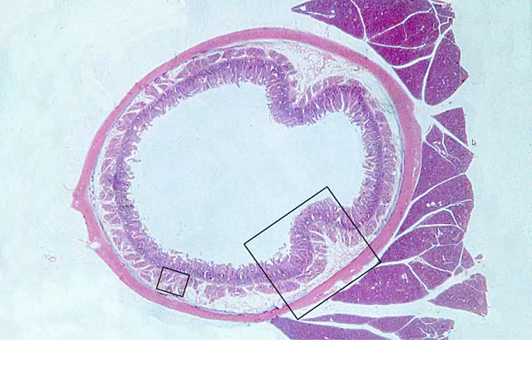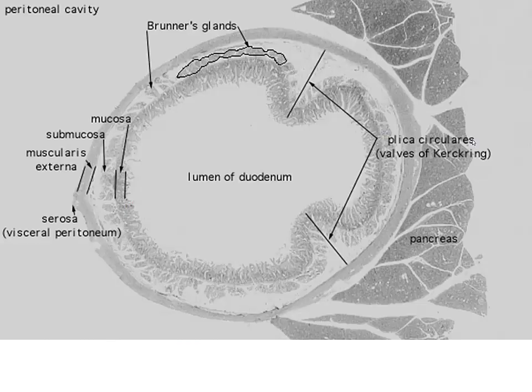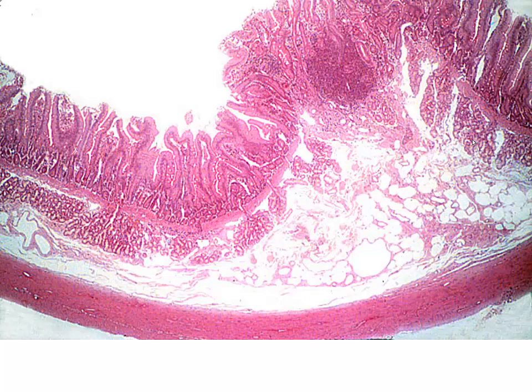Now, again, looking at a different area of this same view of the duodenum. This is where we see one of our plicae circularis. We can see our Brunner's glands, so we know we're in duodenum. And then this extension of our submucosa, we really can't see the smooth muscle that extends up here, but you may have some smooth muscle from the muscularis mucosa into the villi.